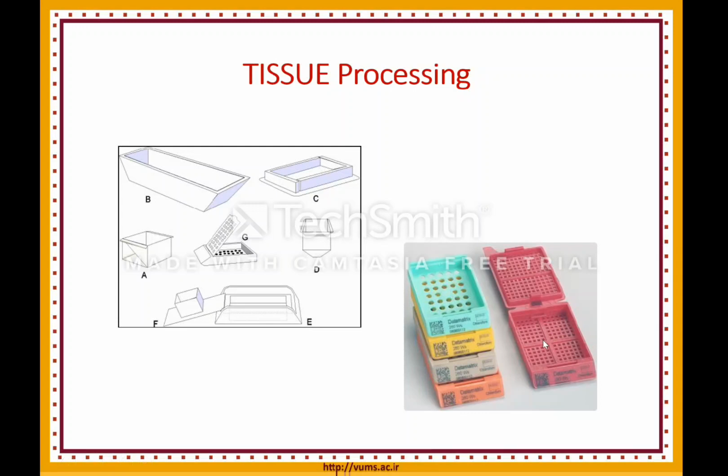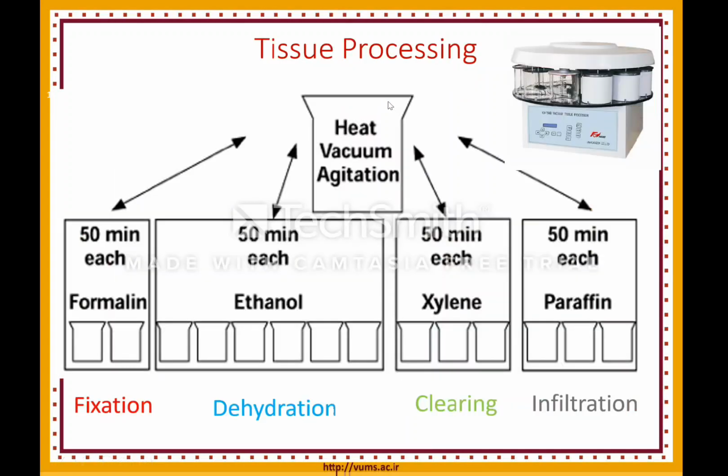After that we can do tissue processing manually, but in most labs they buy this equipment named tissue processor that works automatically.